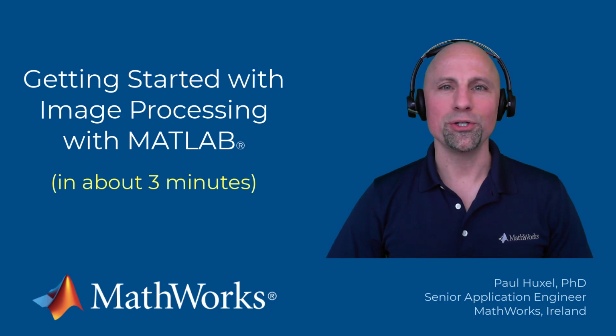Today I'm going to demonstrate how you can get started quickly prototyping image processing tasks in MATLAB before writing any code. In this example, we'll be working with images of thin blood smears, but I encourage you to consider how these techniques might be applied to your own image dataset.